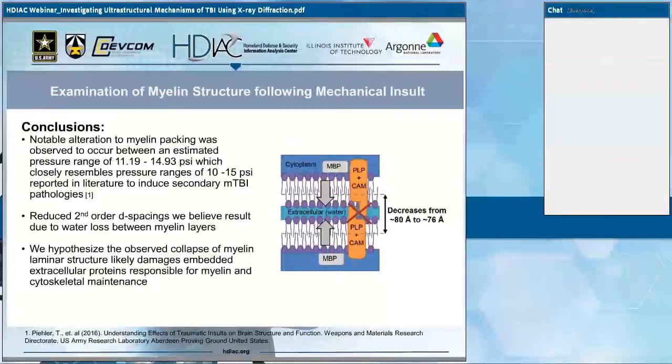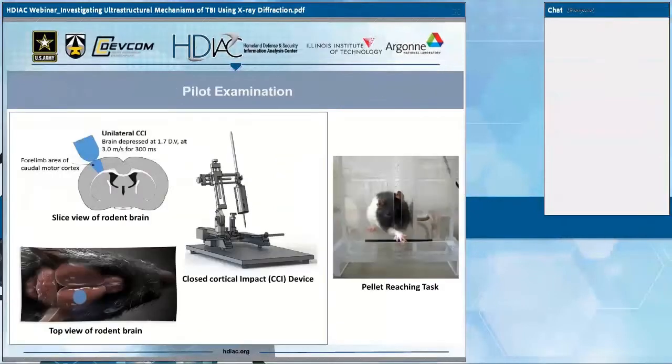While this developed technique allows us to view changes to myelin in small sections of optic nerve, ideally we would like to be able to extend such application in order to scan larger sections of brain to better determine how myelin injuries actually localize. So to scale up from these small areas to full brain. But we need some first steps in order to do this.